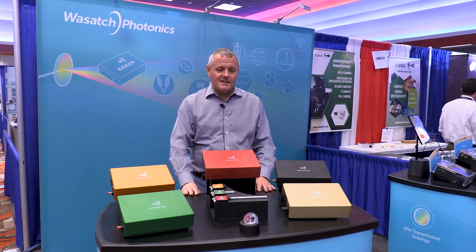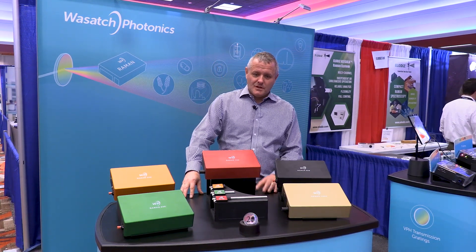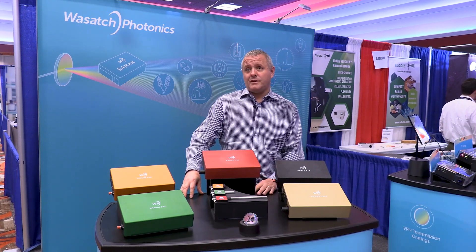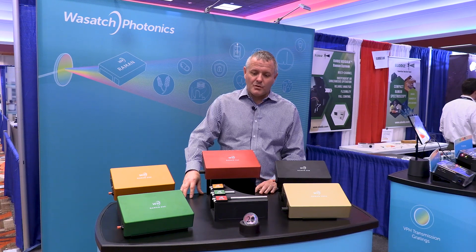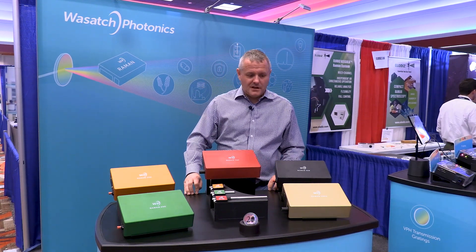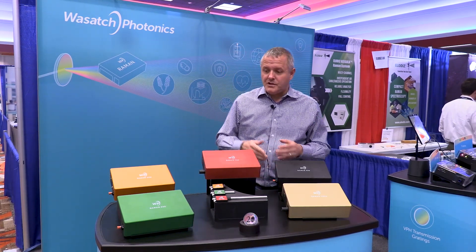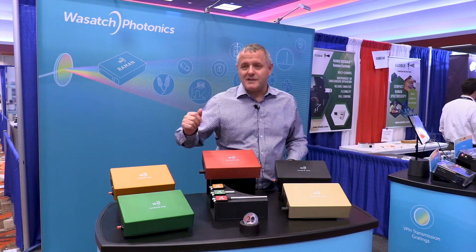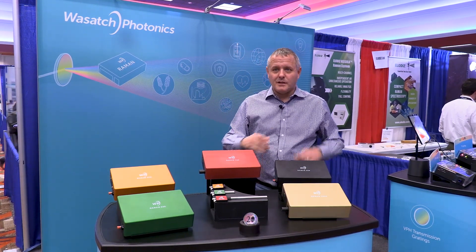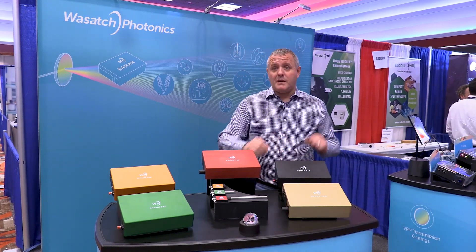This is designed for anybody that believes Raman spectroscopy is important. We don't discriminate between customers — we discriminate between photons. That's the founding principle of what we do. This design is an OEM-inside design. If you were to take the lids off these nicely colored anodized products — we largely try to match the wavelength of the excitation laser to the color of the bench — you'll see an OEM bench inside.